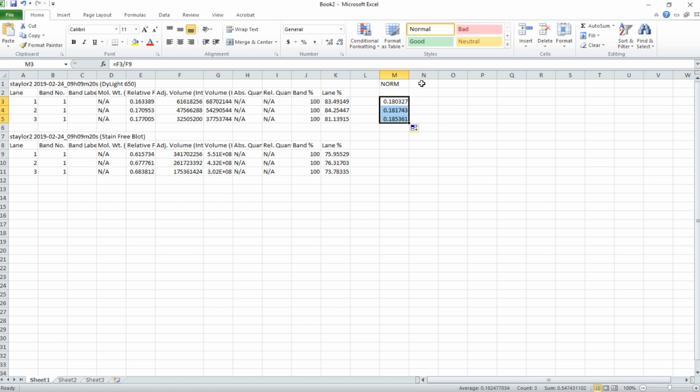If you want to do the full difference between those lanes, typically we would divide the rest of the lanes by a reference lane. So we'll assume lane 1 is our reference lane. So we'll divide our reference lane by itself. Put a couple of dollar signs to make sure I divide the other lanes by the same reference lane. So that's 1, and copy that down. So all the other lanes are the same as the reference lane pretty much. They're all around 1 because, again, the normalized density did not change between the treatments.